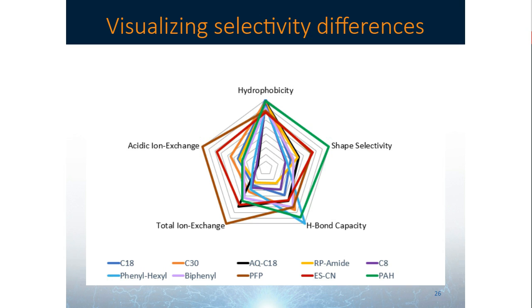So my first suggestion would be to measure the dwell volume on the system where you're using the analytical column compared to the system where you're using the semi-prep column. There are method calculators where you can transfer the method. Just make sure you're using the same linear velocity on both columns, and that will give you a good chance at getting the same separation on the semi-prep column.